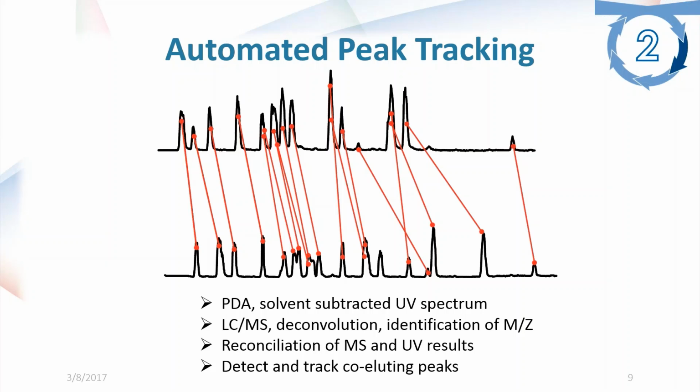And if you have areas where you have peaks that are switching positions, as shown here, 1 second, I'll just use my highlighter. So where you see peak switching position or new peaks that are appearing that weren't present previously, that becomes very challenging. And we're only looking at 2 chromatograms right now. Imagine doing that for 16, 32, or more injections.